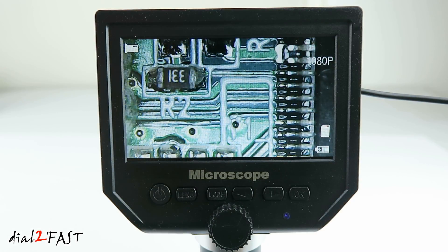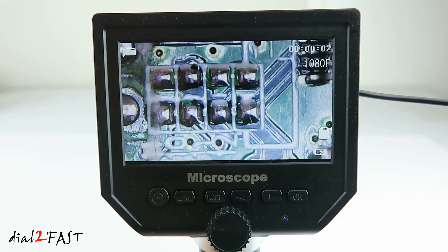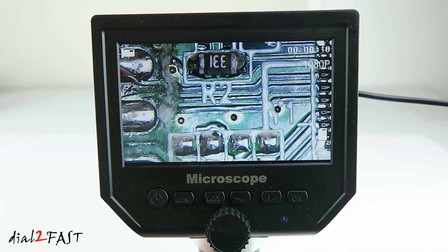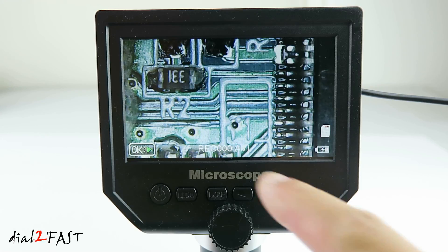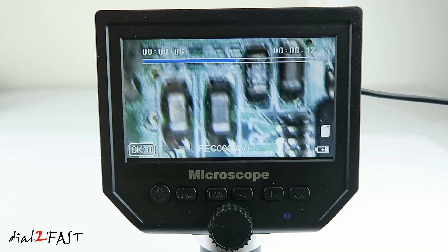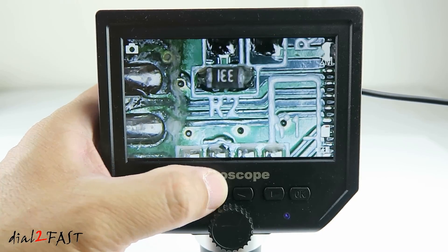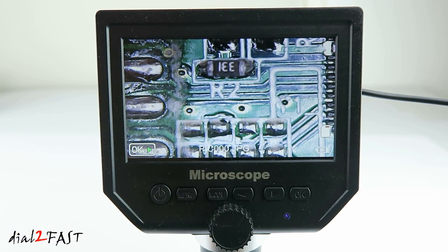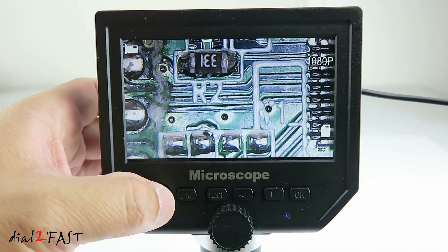I've gone ahead and installed a micro SD memory card into the unit. While we're in video mode, if you press the OK button it will start recording. This unit records an AVI video file. When you're done, press the OK button. Press the mode button to toggle to the playback mode — here's the video file, press OK to play it. Press the mode button to camera mode and press OK to take a snapshot. Press the mode button again to go into playback mode — you can press the right or left arrow to scroll through different pictures and videos. To turn off the unit, simply press and hold the power button for a second.